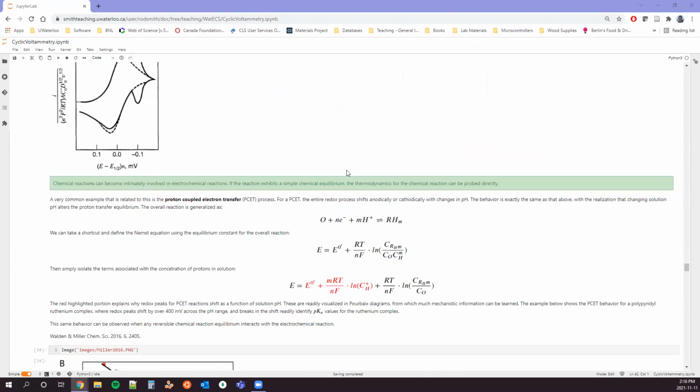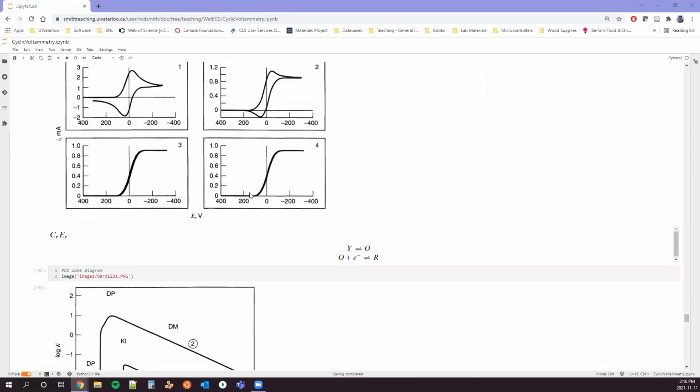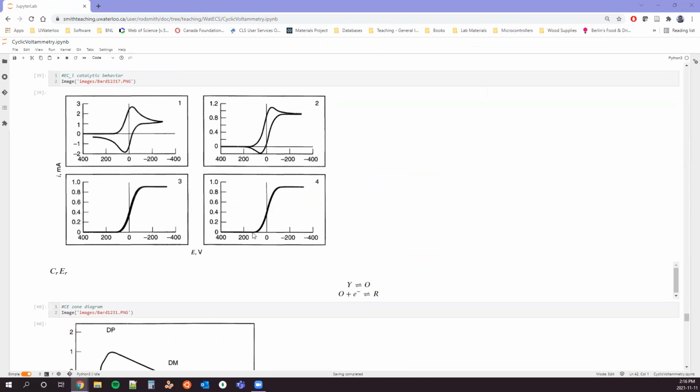An ultramicroelectrode behavior looks something like this. If you scan it at a rate such that diffusion does start factoring in, it'll move towards example two here. So this would be no diffusion problems, and this would be diffusion starting to factor in. Okay, thank you.